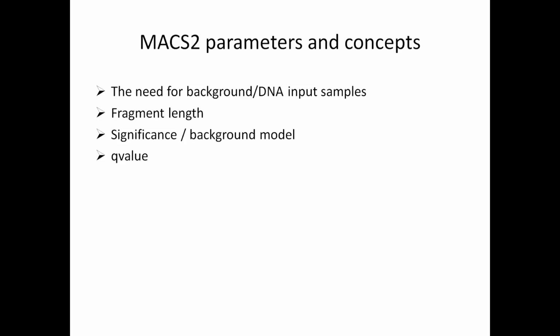I will then sort the binding regions by the fold enrichment value, which is found in the detailed spreadsheet of results, but I'll explain that later. And the fold enrichment value compares the chip fragment count in the binding region against the local background or lambda model.